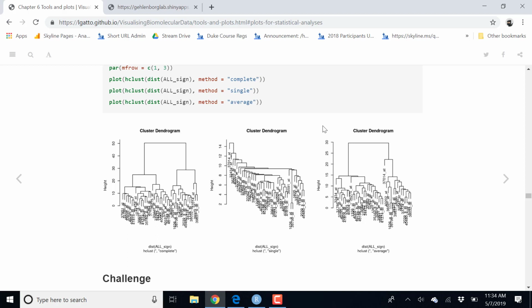So generally, the complete clustering method is what is used and probably works in most cases. And of course, trying fancy or different methods is not always useful because we have some expectations when we look at the graph. There is some benefit of keeping defaults so that we know what to expect when we look at the graph. So changing the parameters left, right, and center is not useful. We need some consistency to be able to look at these graphs and make some interpretation. But anyway, it's important to know that we have parameters that will influence our results.